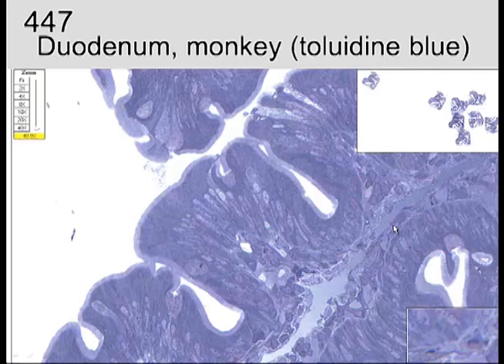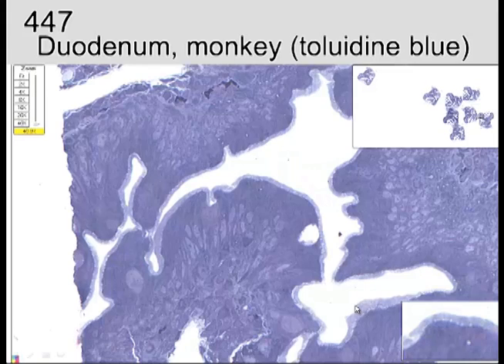Central lacteal, as we see through there, there's places here where there would be blood vessels running through. There's a capillary right in through there. Here we can see another one. Again, we can see the brush border projecting up. Individual columnar cells, more cytoplasm above the nucleus and between nuclei, so a simple columnar epithelium lining these.